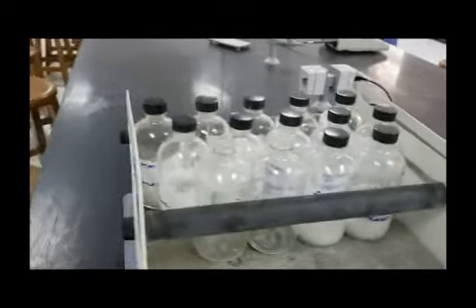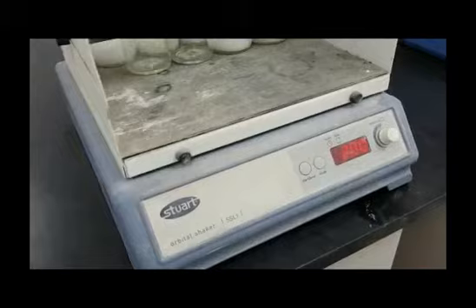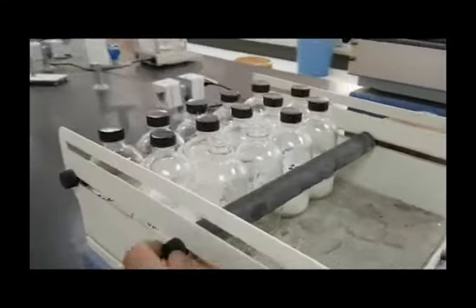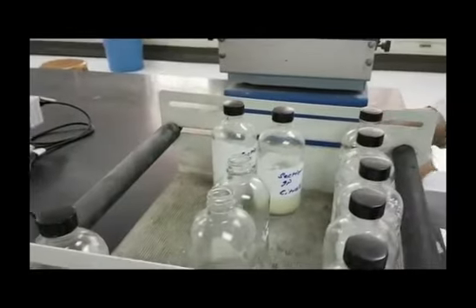Remember to always clean thoroughly all equipment, tools, and working area before and after working. And also remember that many of these steps are and should be done in parallel.